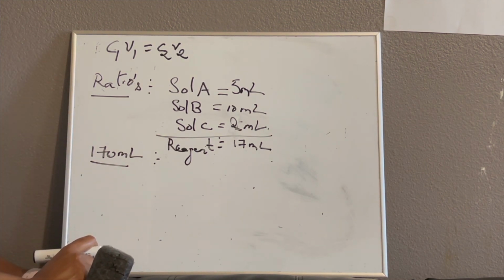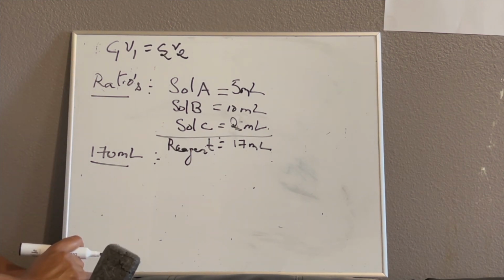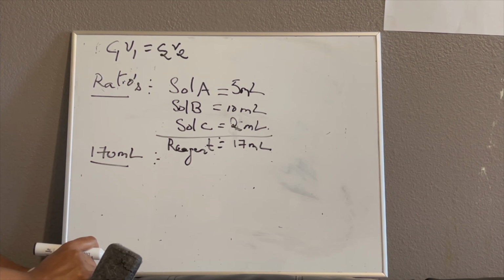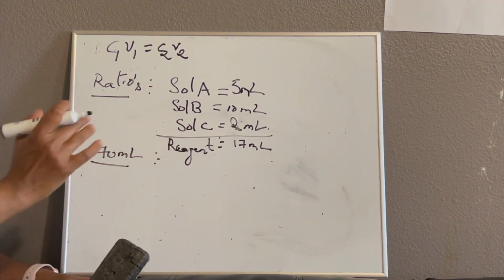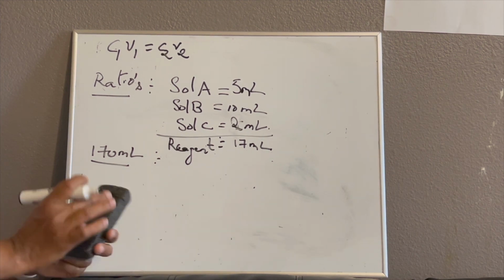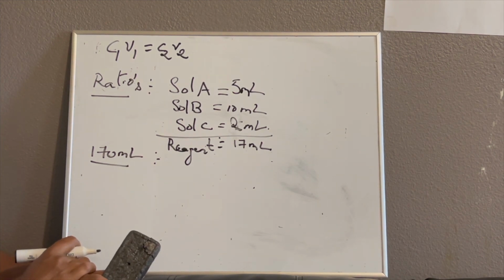The reason I figured out was that the extraction and purification processes may be different for different brands. So there may be something during the extraction process which might be hindering the reaction or the assay. I had this kind of issue in a few of my assays. But if the compound is 100% pure, you should not have any issue. So these are a few of my experiences working in my lab.